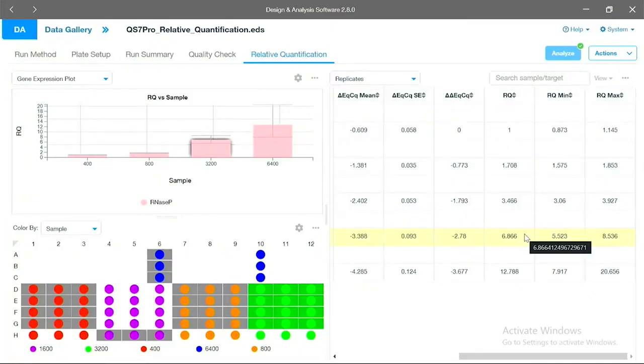So typically you're only going to see melt curves as part of a SYBR type reaction, which is a reversible signal. When you have double-stranded DNA, it sticks. If you heat it up and denature that DNA and make it single-stranded simply by heat, the SYBR molecule will fall off and you will get no signal, which is what we take advantage of in a melt curve. So let's look at a melt curve.